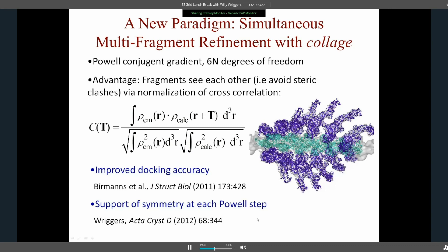Symmetry is also supported in Cytos. A symmetry builder creates symmetry mates at every iteration step, and you can run this in a bash shell with symmetry constraints turned on. Helical symmetries are supported, as well as C and D symmetry widely used in EM. That gives more accurate fitting compared to individual fits of single fragments, and allows you to take advantage of the known symmetry of the EM map.